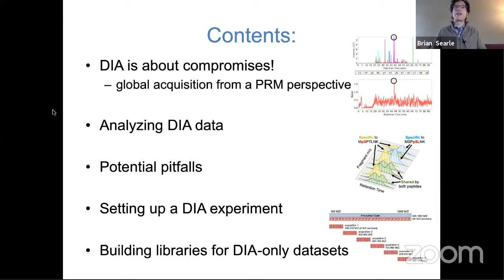And so that's one of the reasons why we developed this approach to use gas phase fractionation to essentially correct the Prosit predictions, both in terms of fragmentation patterns as well as retention time standards.